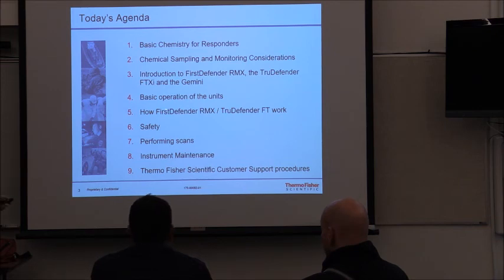So I'll talk about some of the basic operation. We'll have a chance to play with it. So I brought some products. We'll play with it as we're going through the evolution on the slide deck and so forth. And then really at the end, my big thing is I want you to be comfortable taking samples, getting hits, and getting reads.